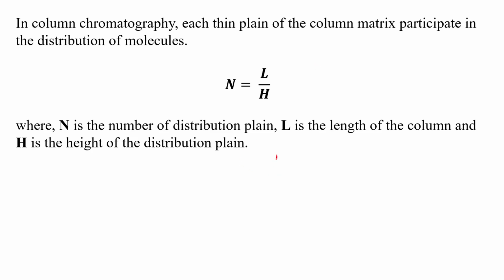Basically, again I'll draw a rough column. So basically you have this column, right, and it is packed with your stationary phase.